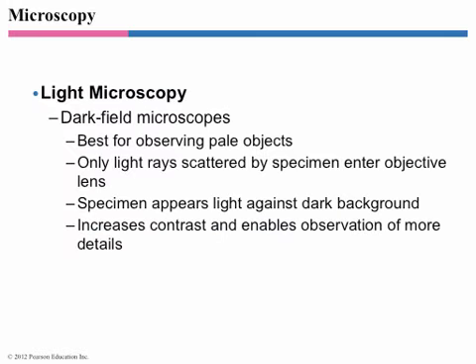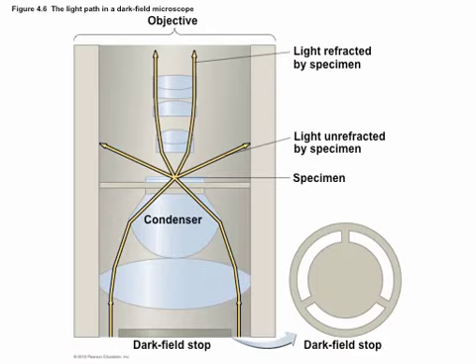So that was bright field microscopy, where you're looking at the shadow of something on a bright background. Dark field microscopy is, well, you're looking at bright objects on a dark background. How does that work, you ask? Or maybe you don't ask. Either way, I'm going to tell you. Basically, what happens is the light is not headed towards your eyes. You're looking down at it. The light's going that way. If there's no sample there, you look down and it looks black because all of the light's headed that way. None of it hits your eyes.